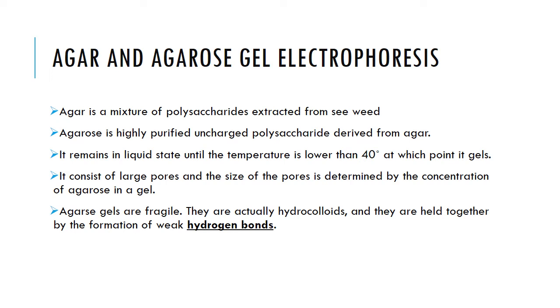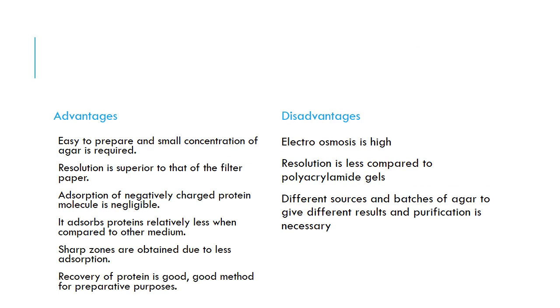Now, in between these polysaccharides, we have a bond, which is the hydrogen bond, which we know to be what? A weak bond. So we should always have in mind that the bond between the polysaccharides in the agarose gel is what? Hydrogen bond. That's very important.